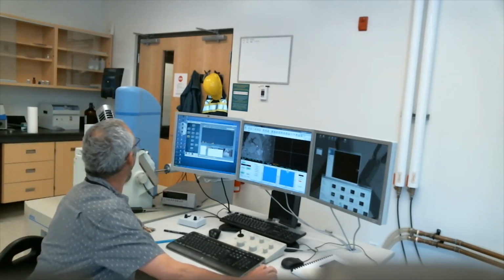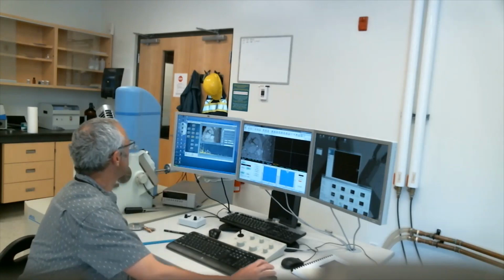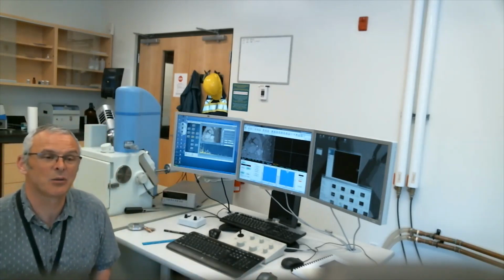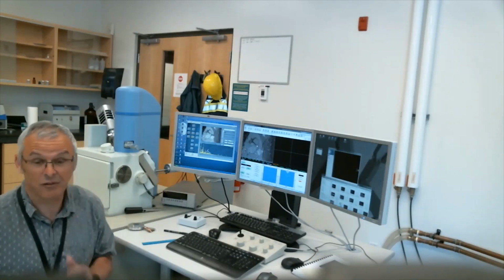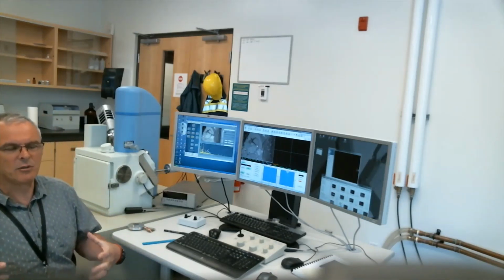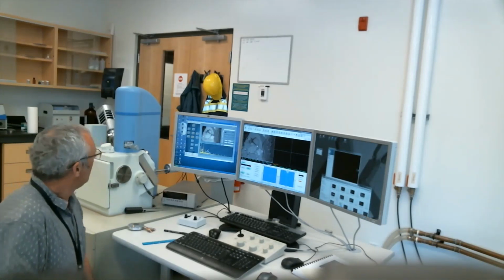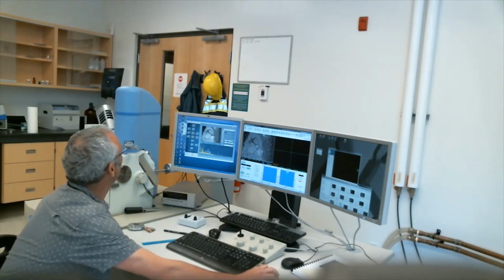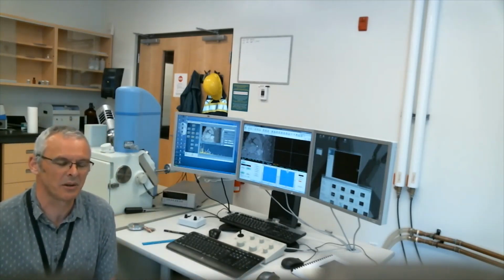And then the other thing I wanted to show you is this very bright green here, which I still haven't identified. Very bright phase, and we'll see why it's bright in a second. It's bright because it contains 15 to 20% UO2, uranium dioxide. So it's a uranium-bearing phase, makes it very bright, produces a huge amount of backscattered electrons. Problem is that all these grains are quite small. Like that grain is one of the bigger ones I've seen, and it is 30 microns.